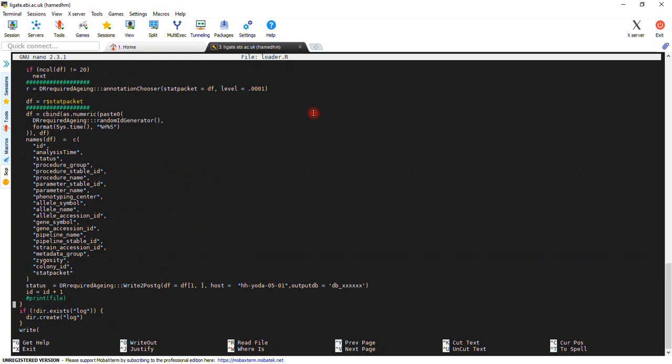except the DB connections. So it is in this line you see the host is this one, and DB name. This is basically the table name, and I normally put dates in it. Today is 05/10/2020, and I put a time in it. Time is 15:52. Okay, so this is the only modification you'd require to do in this file.